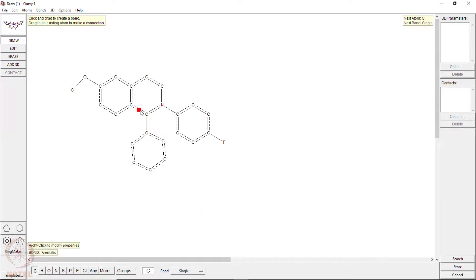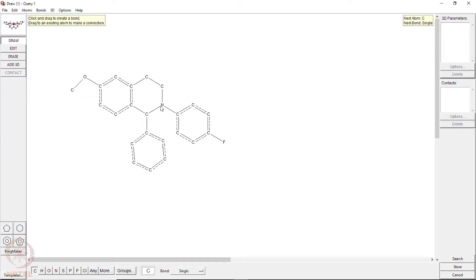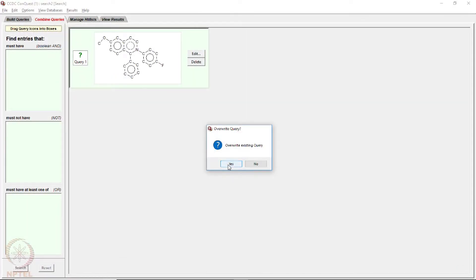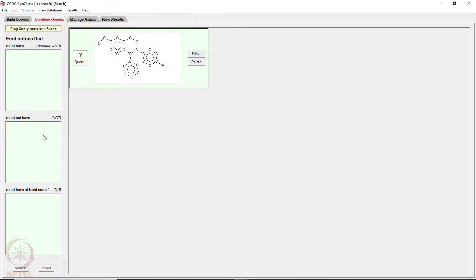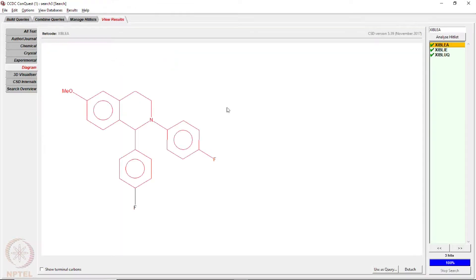Let us now make this ring saturated, so it becomes a tetrahydroisoquinoline. You have 2 hydrogens there, 2 hydrogens here, and 1 hydrogen here. We perform a search, overwrite the query, and now there are 3 structures showing up.